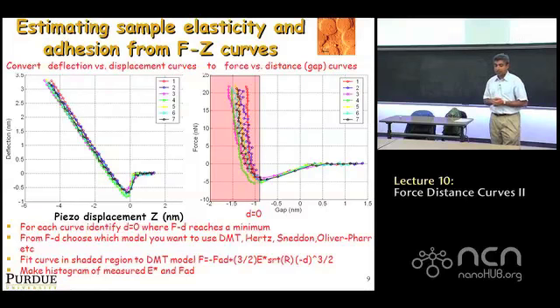There are other ways. You can, for example, scan gratings of known sizes and try to back out what the tip radius is using tip deconvolution software called SPIP. We'll talk about these things later in the class, but all those things are possible, but perhaps the easiest non-destructive way is to take high-resolution SEM images in two orthogonal planes and try to fit as best as you can an appropriate tip radius to the tip.